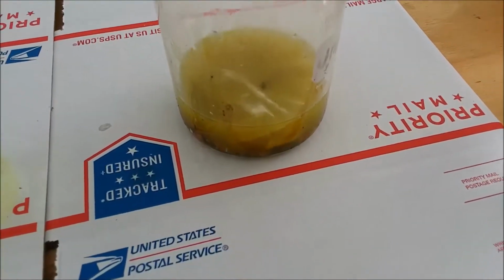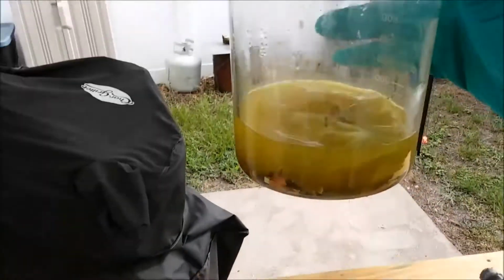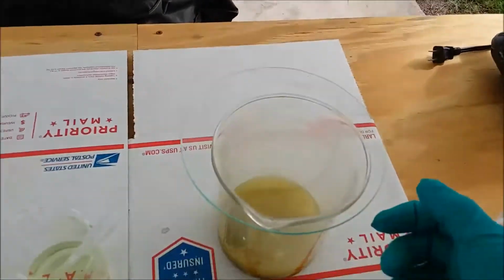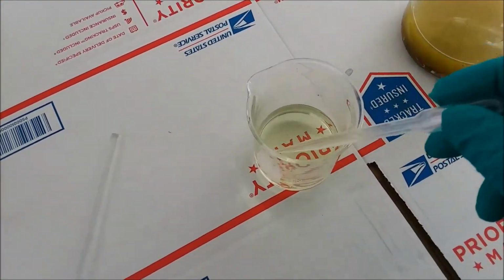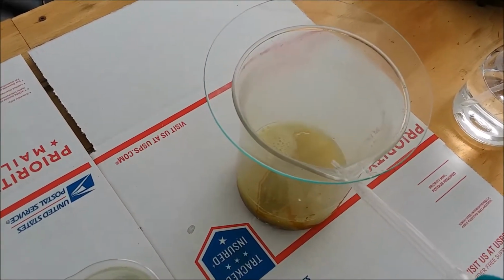Okay, it's been about 20 minutes, I guess. I went and did some other stuff and came back and looked at it, and it does look like some of the gold has dissolved. There's still plenty in there though, and there doesn't seem to be much of a reaction going on at the moment, so I think I'm going to put a few more squirts of bleach in here.